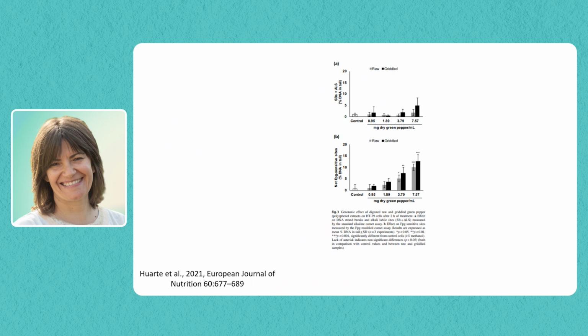Sorry? It was HT29. They have a bit of metabolic activity, but not that much. So maybe if you put the metabolic activation, these effects disappear. You never know. I mean, you have to take everything into account.